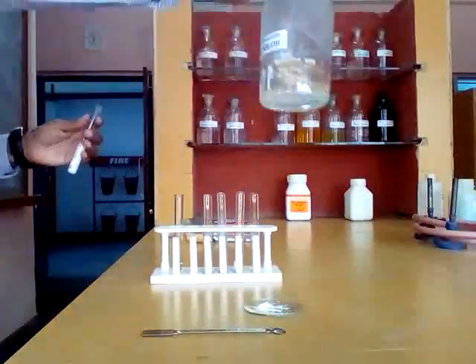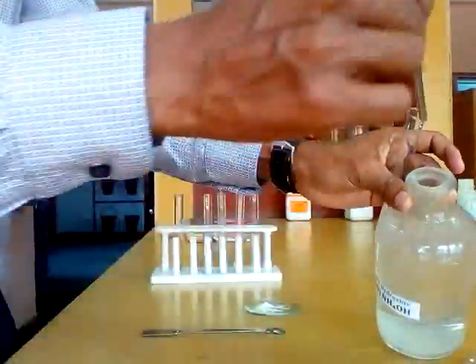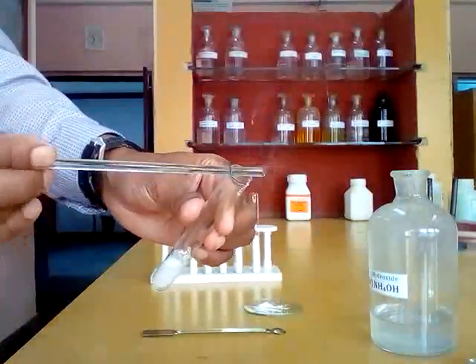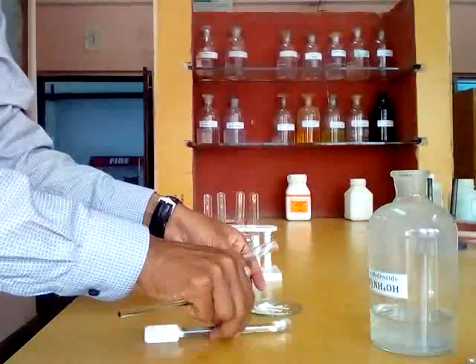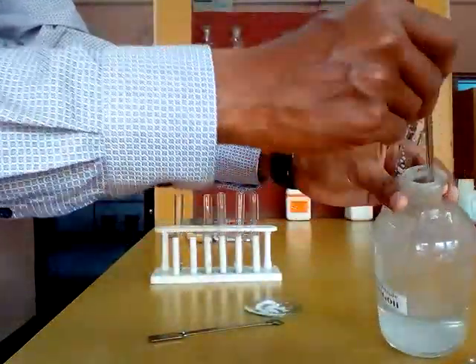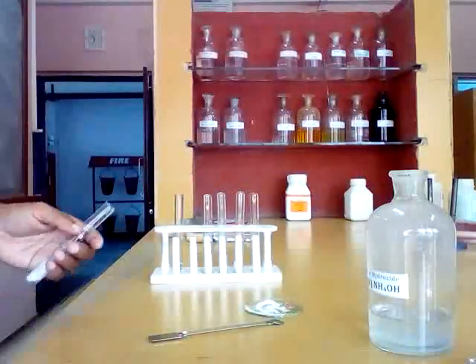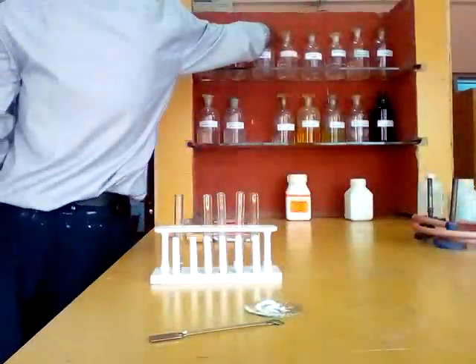If you get this type of observation, then you do one thing: you take a glass rod and dip the glass rod in ammonium hydroxide solution and place the glass rod on the mouth of the test tube. Then you will get dense white fumes. You see, this is the dense white fumes of ammonium chloride. So we got the observation for chloride radical.